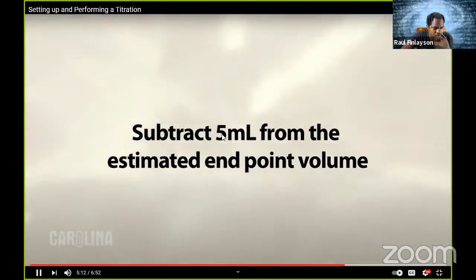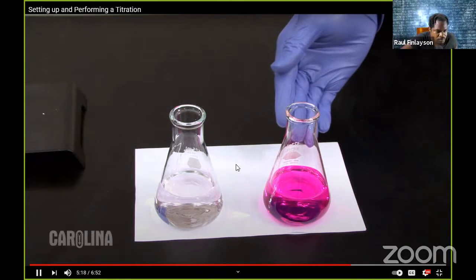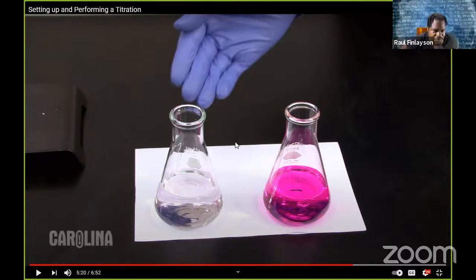Added before a slower addition is required. As the estimate titration shows, a dark colored solution indicates an excess of titrant has been added. Now, the next thing with the indicator, guys: if the color is too sharp or too dark, you've added too much of the substance. So you want it to be just right when it is done, and the color change shouldn't be so drastic.